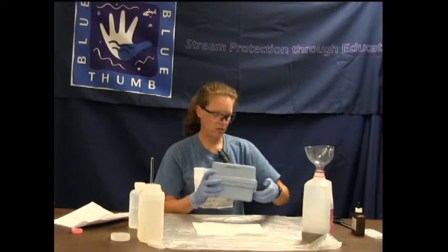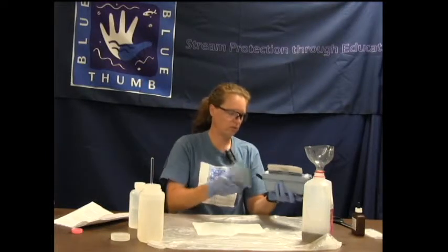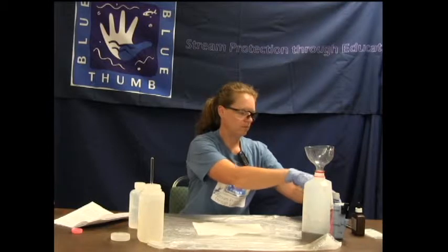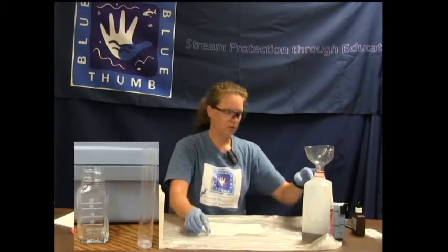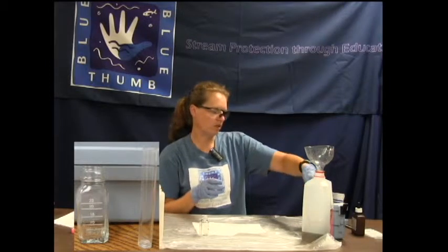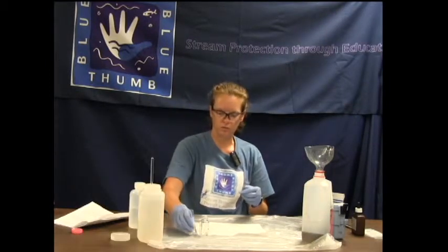The chloride test kit is going to include a square mixing bottle with markings on it, and for the high range test there will be a plastic measuring tube.